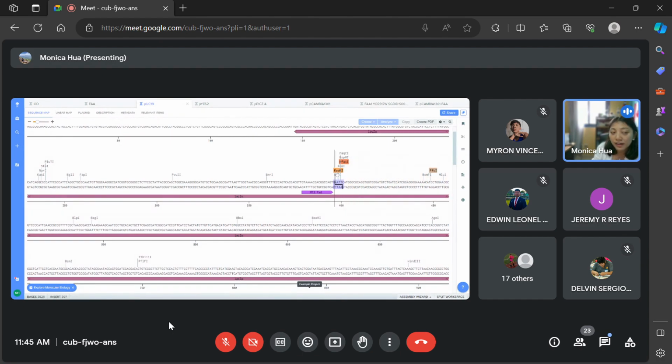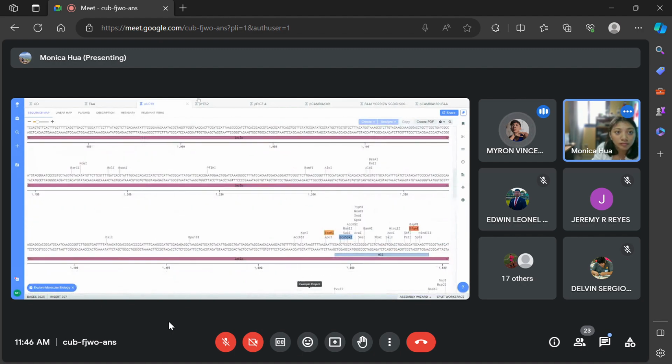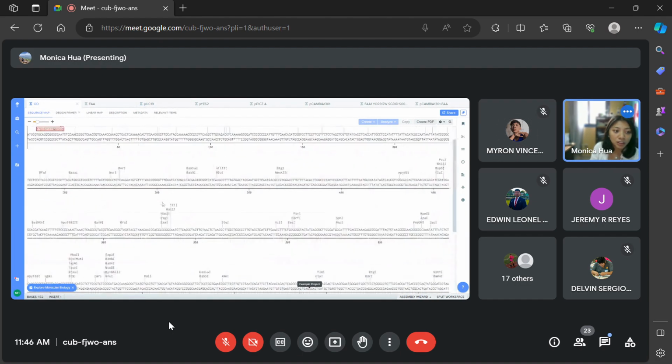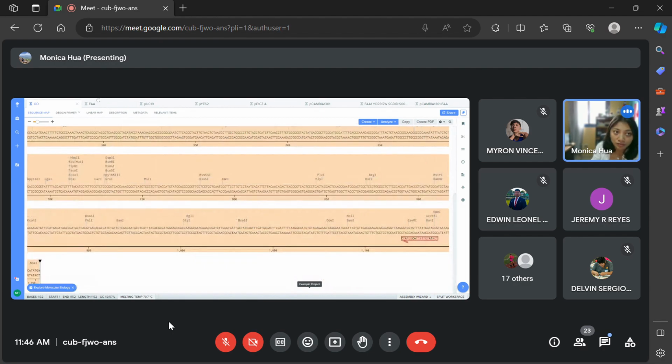And then we have one final thing. When you copy the sequence of the OD, you have to copy everything, from restriction enzyme site to restriction enzyme site. You could do CTRL-A, which should be everything, and you just copy it. So everything that you have created thus far.